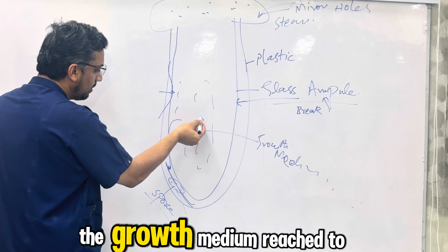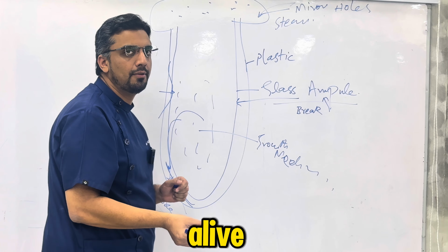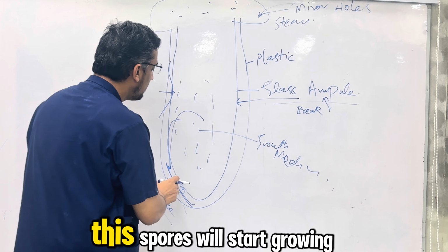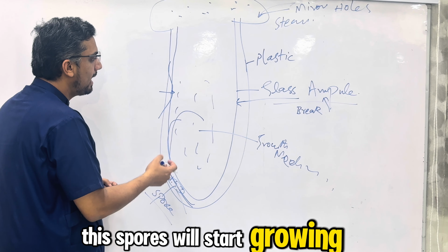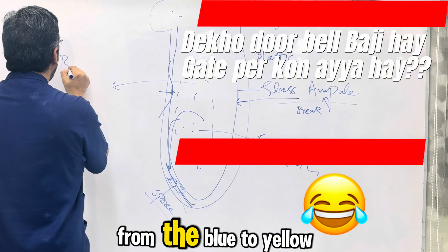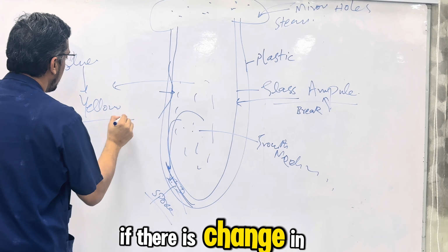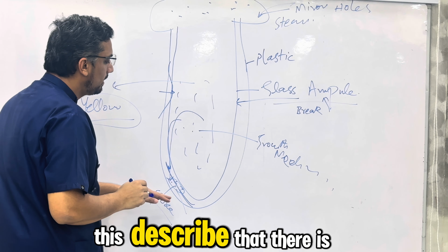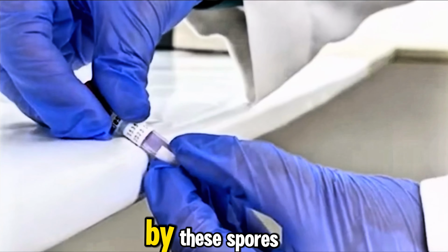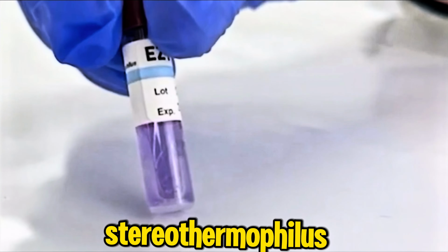After this break, the growth medium reaches the spores, and if these spores are alive because of any malfunctioning of the autoclave, the spores will start growing and this medium will turn from blue to yellow. If there is a change in the color, this indicates that there is growth in the growth medium by these spores, and these spores are Geobacillus stearothermophilus.